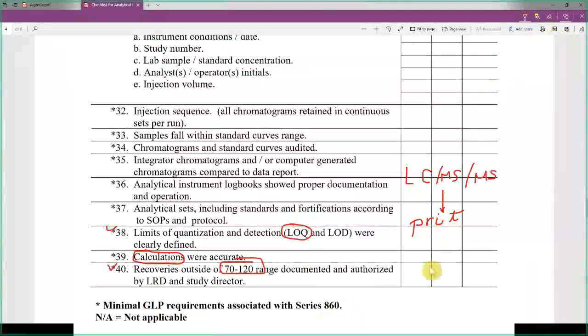Okay, so the instrument software will print out the results. In this case, most likely those results are good and valid. It should be fine. But the thing is, when you do the calculation, you cannot simply rely on that. And also you need to show everyone you have enough evidence that you can calculate it yourself.